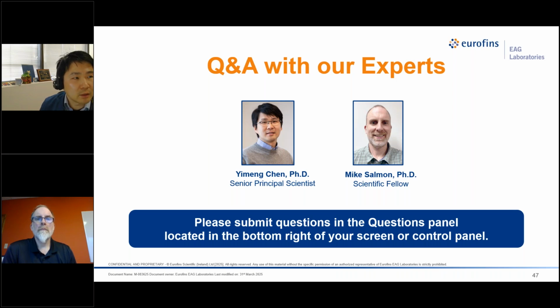And for carbon, usually we can achieve a good measurement, but there are also some considerations like detector pile up or multi-hits, lots of ion counts in the multi-hits. So there are a lot of considerations for light element measurements too. So if you have more questions, I will reply to that question in a separate email.